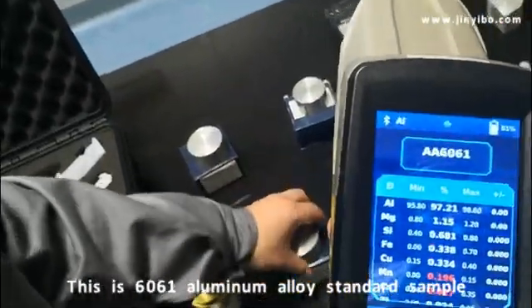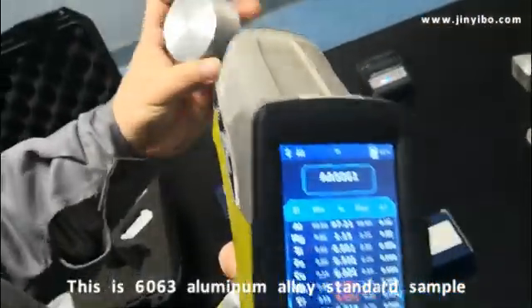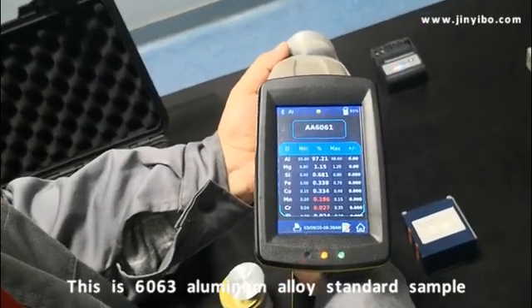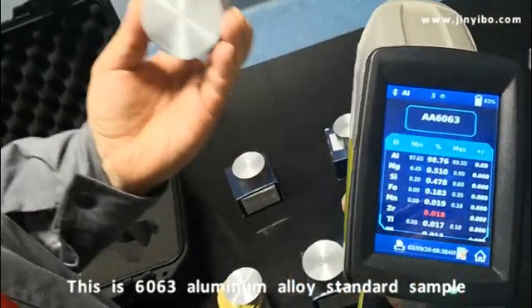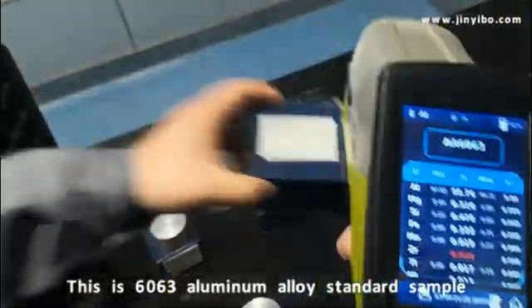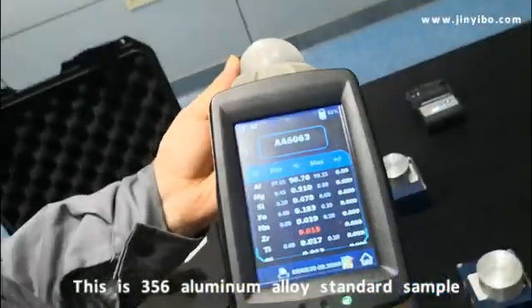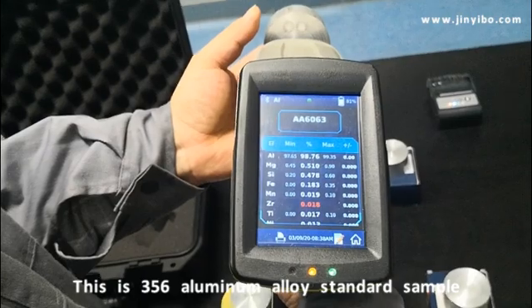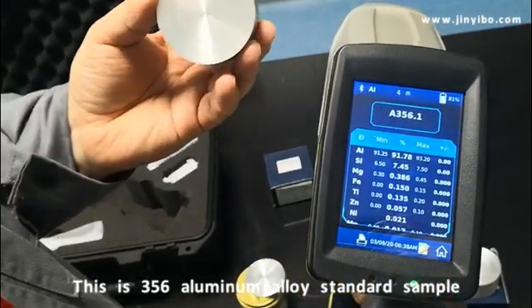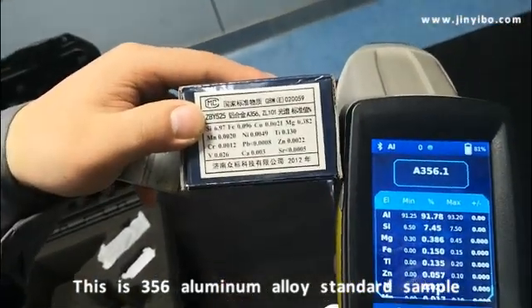Now we change to this sample. The result is 6063 — confirmed 6063. Now we change to this sample, and the result is 356, confirmed 356.